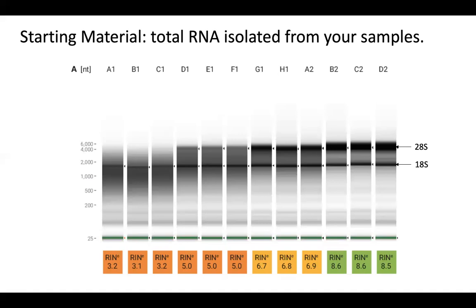And the intensity of the bands can tell you something about the quality. So if these are breaking down, they will also disappear, which you can see in this picture. On the left, you see RNAs of poor quality. What you can basically see is the top band, the 28S band, is almost fully degraded. And you can see a grayish smear between 500 to 2000 bases.